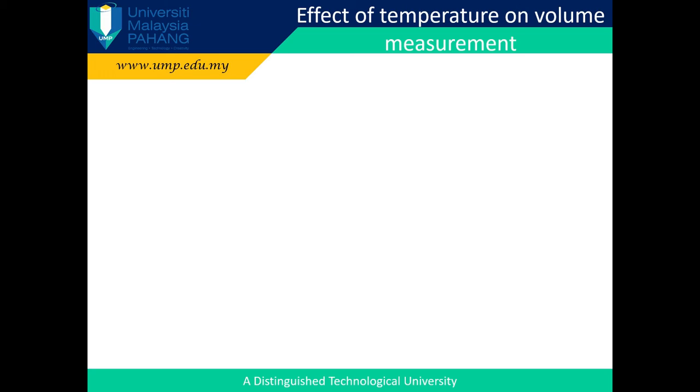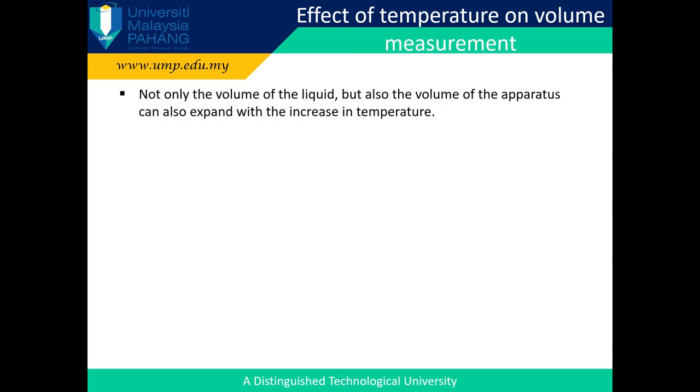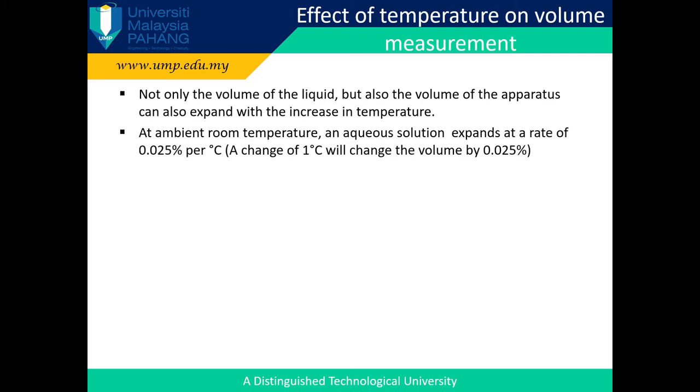Effect of temperature on volume measurement. Not only the volume of the liquid, but also the volume of the apparatus can expand with the increase in temperature. At ambient room temperature, an aqueous solution expands at a rate of 0.025% per degree Celsius. A change of 1 degree Celsius will change the volume by 0.025%.